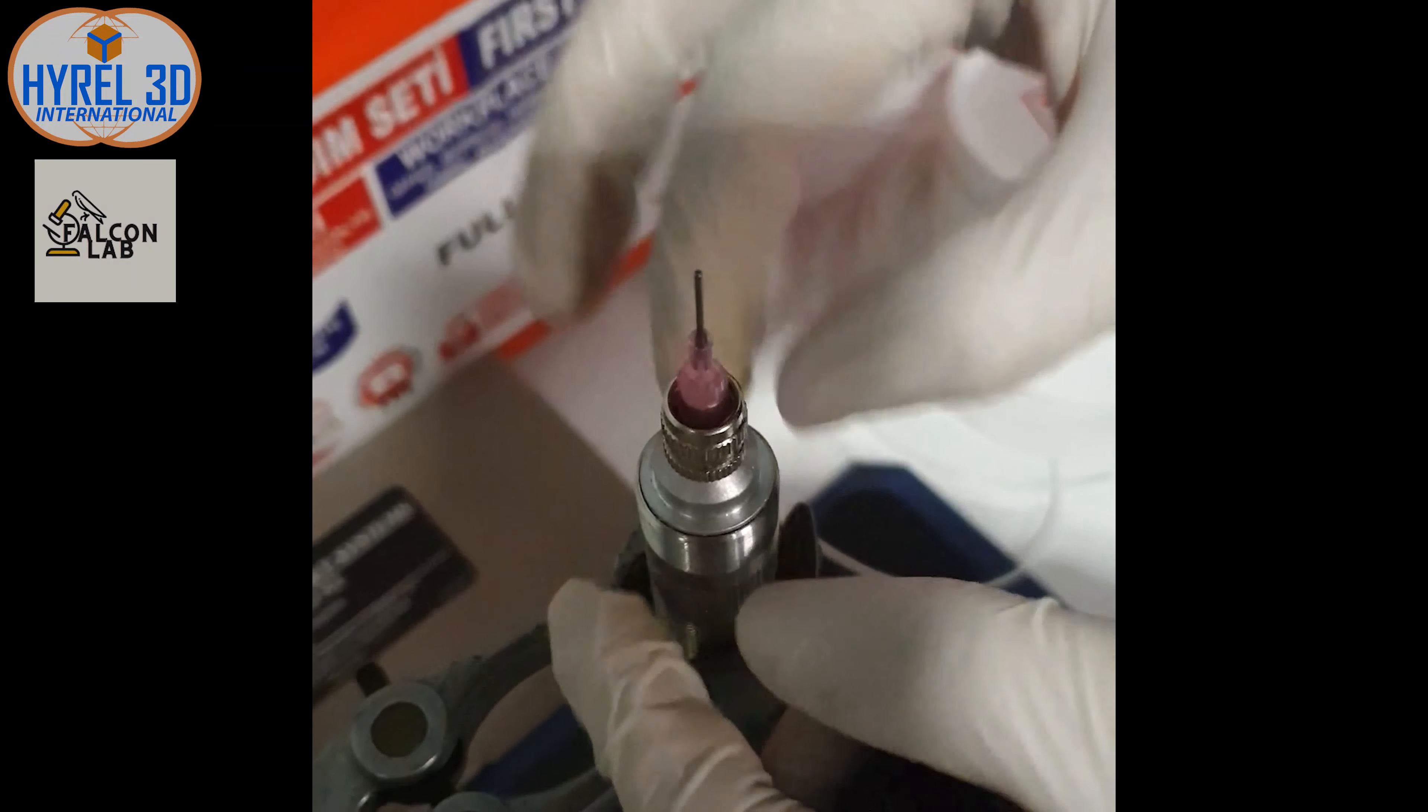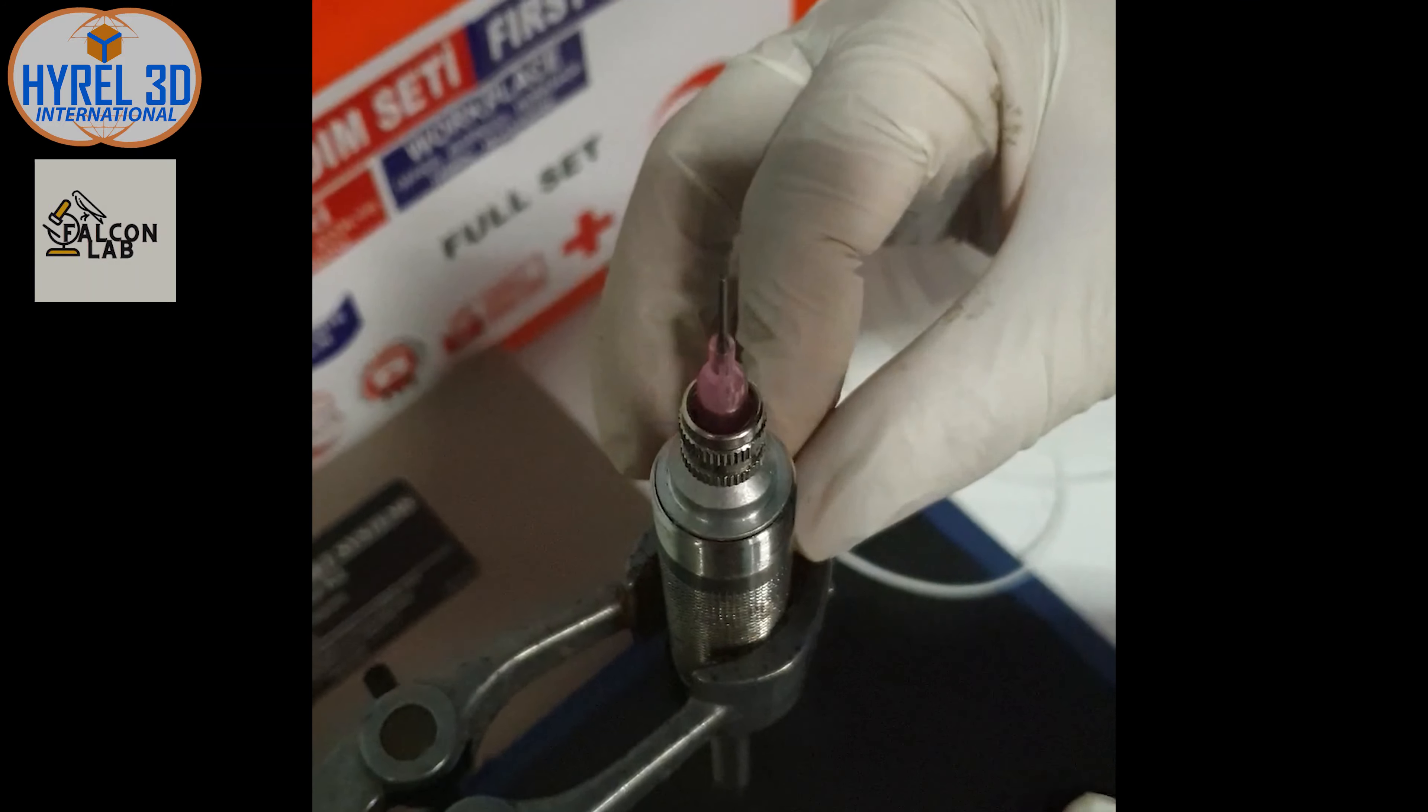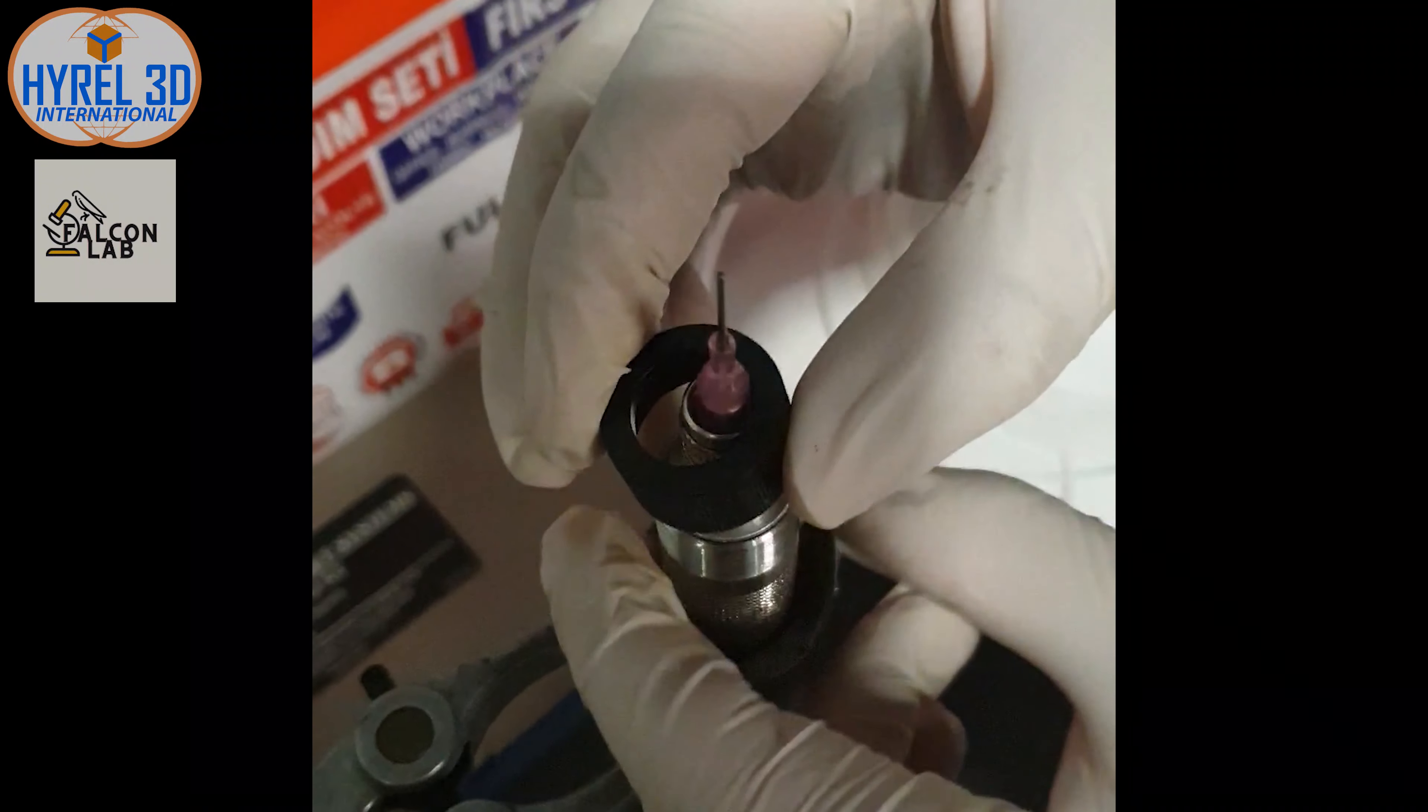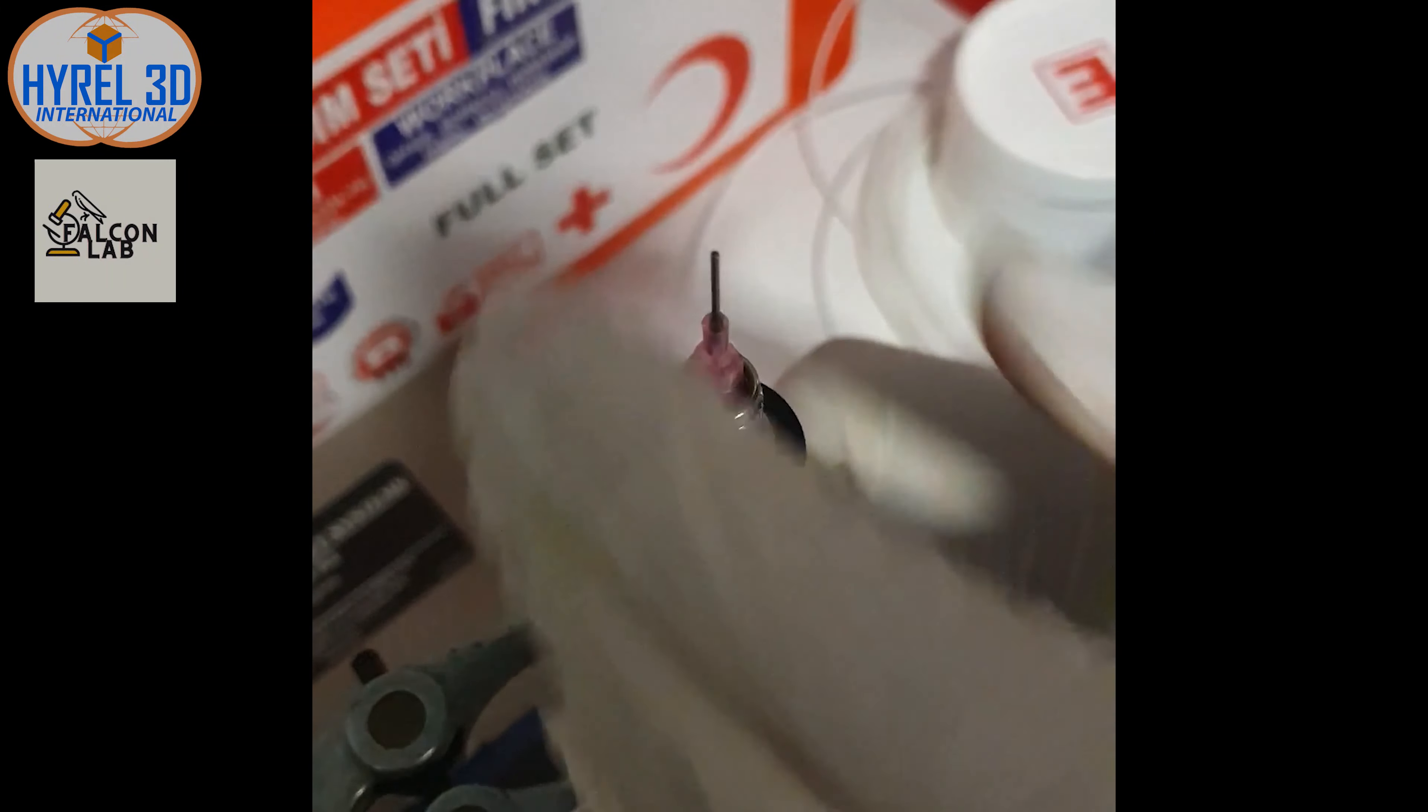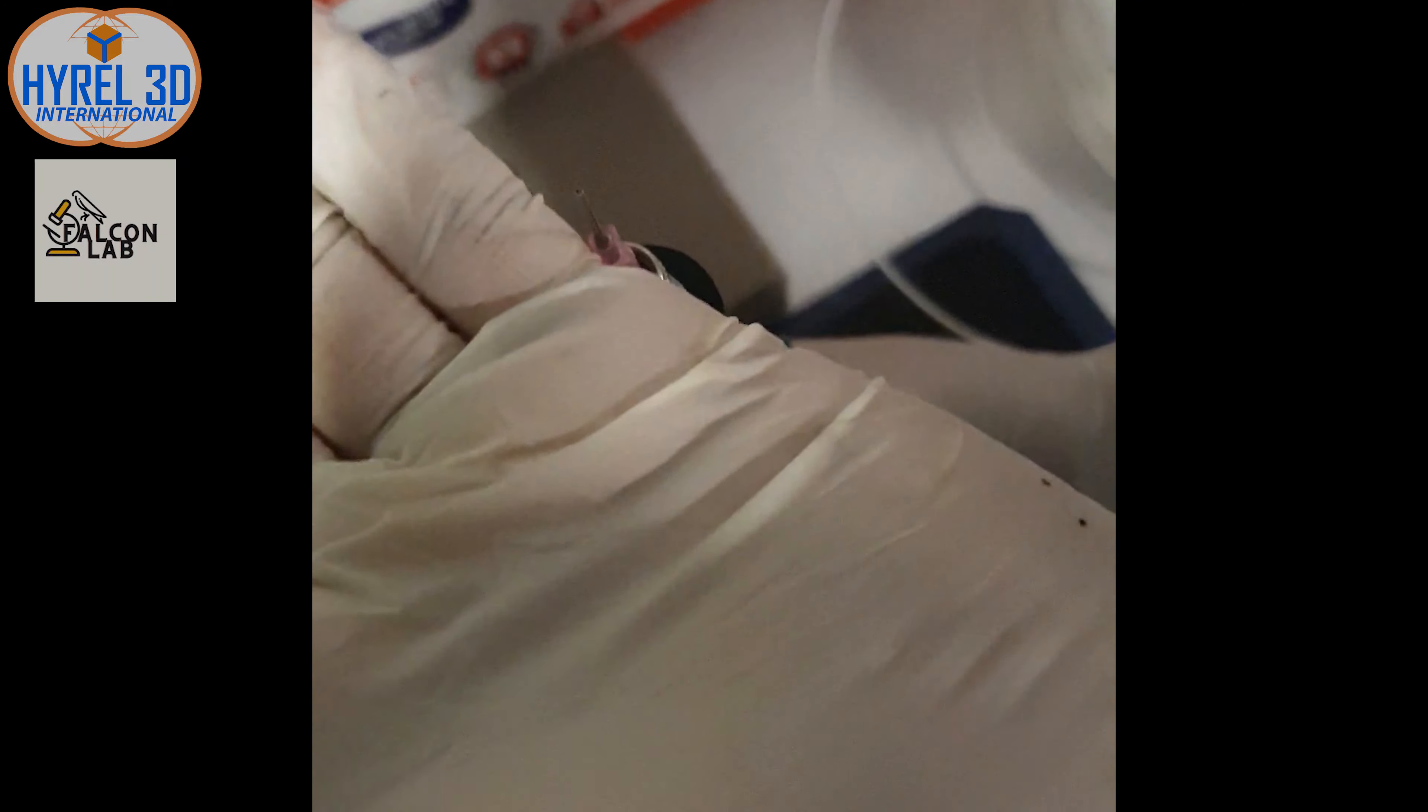We will close the cartridge now using the special tip to press the mixture. We will seal it tightly using the black cap.